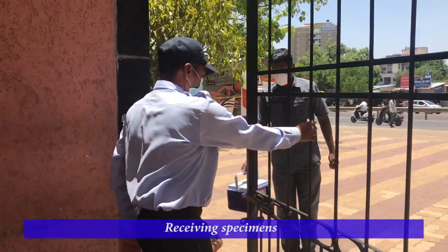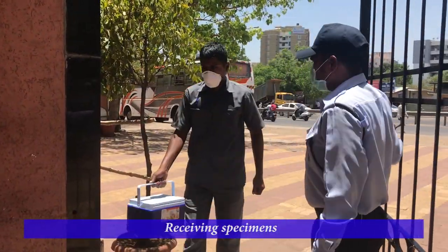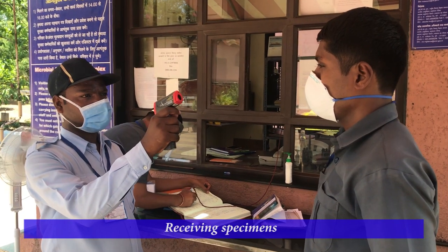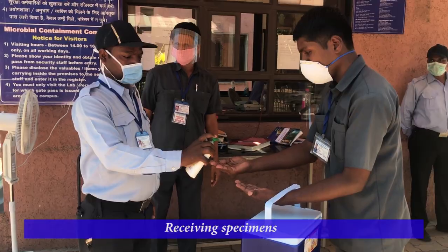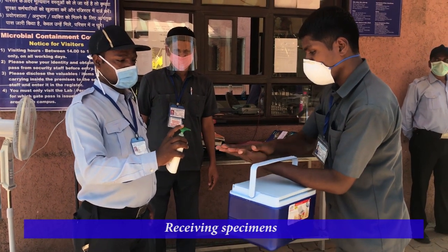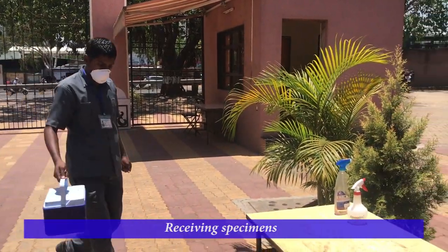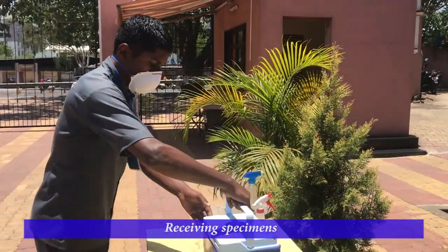The container carrying the specimens is brought by the hospital staff and delivered at the institute gate. As per government rules, the person will be scanned by a thermal scanner. The hospital staff will keep the container on the designated area and disinfect the container.